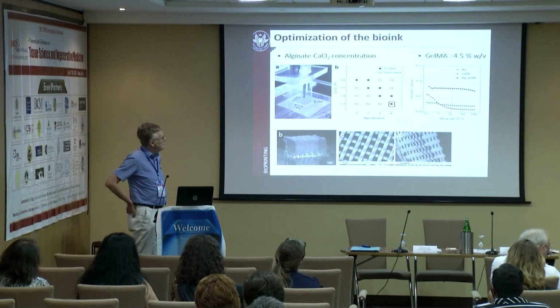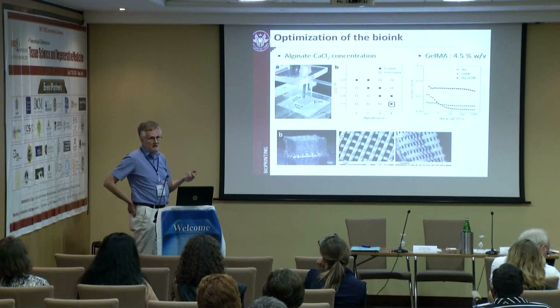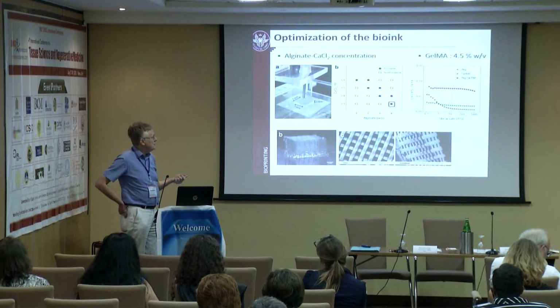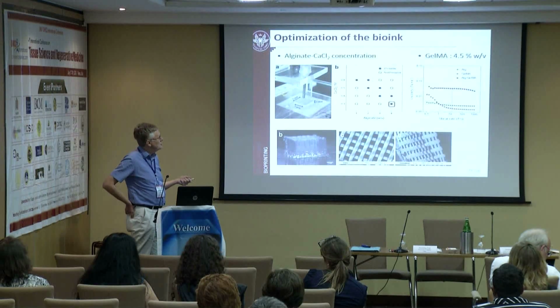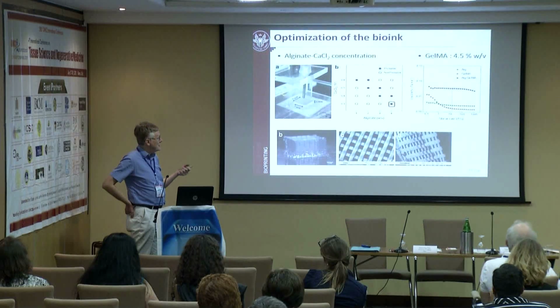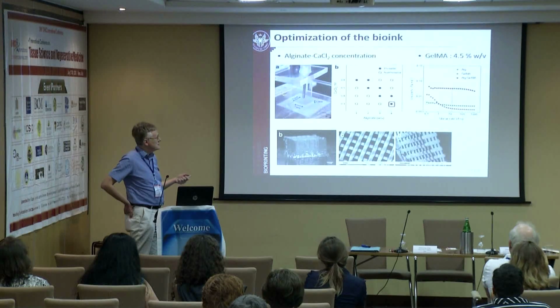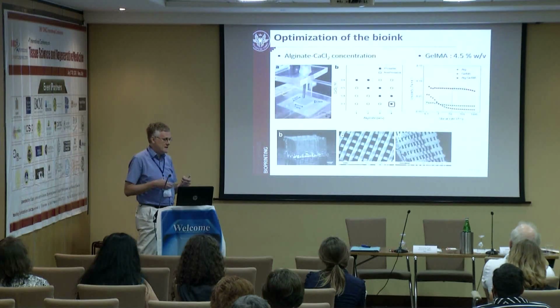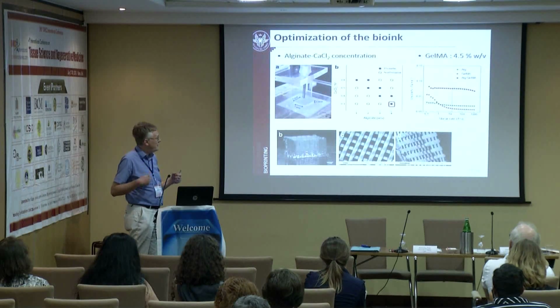As you can see, the bioink exhibits almost a Newtonian behavior in most of the shear rate range explored, and the viscosity is relatively low. In the usual bioprinting practice, solutions characterized by high viscosity and that exhibit a high shear thinning response during extrusion are used. This is to avoid that the printed strand spreads out on the surface.